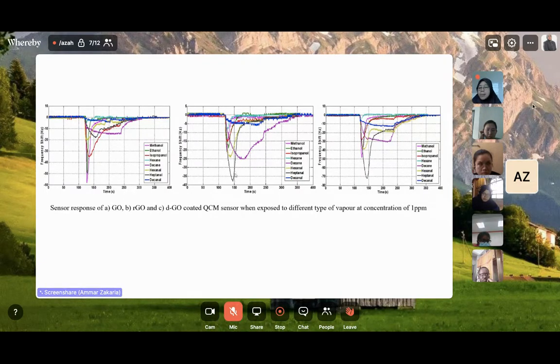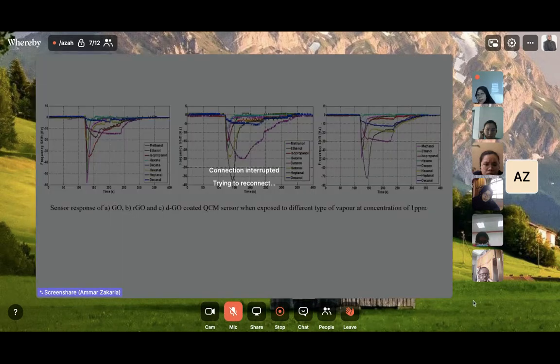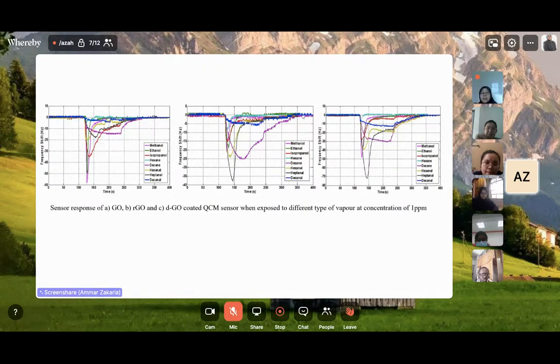And then when you push it back again, the sensor should be able to go to recovery mode and then the baseline again. Now, let's say you sniff on the baseline and you push, and somehow the sensor will not go back to the baseline, right? Then you will have trouble differentiating. Then you need to apply signal processing and so on, right?